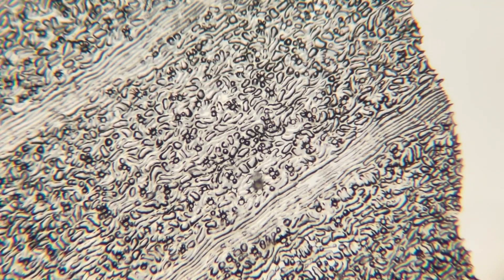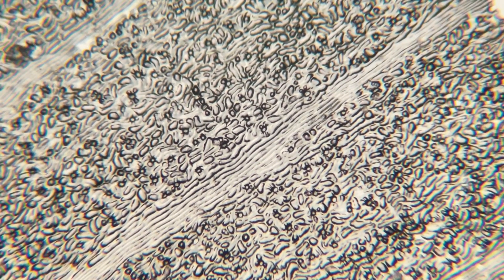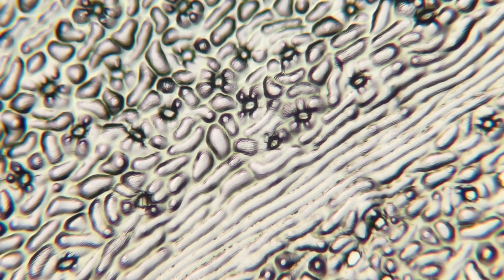What we are seeing now is the beautiful pattern of the underside of the leaf. We see the cells that form the veins of the leaf and we also see the stomata. Stomata are the pores used by plants to capture CO2 and to release oxygen.